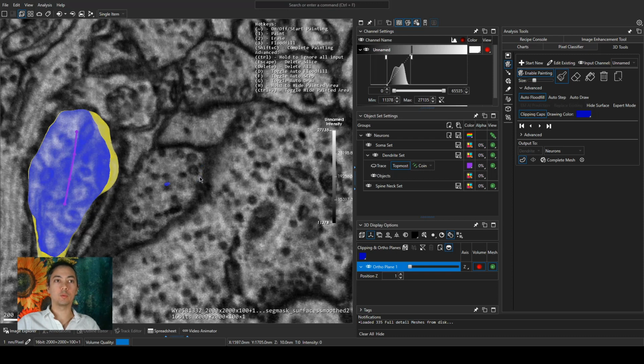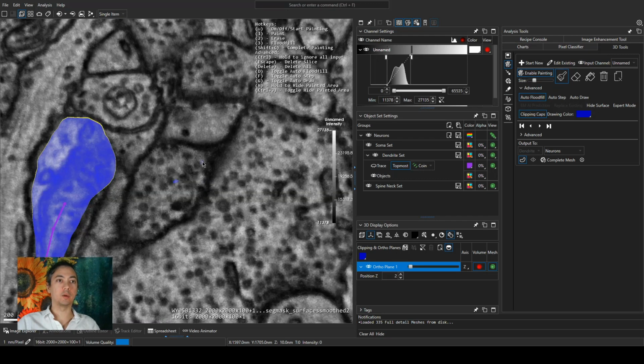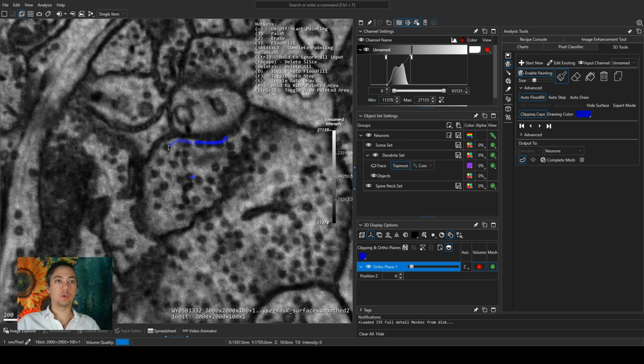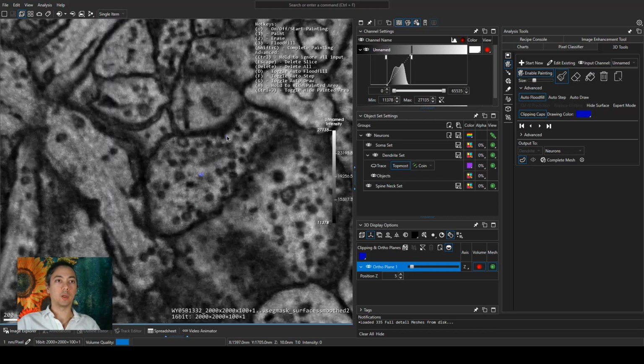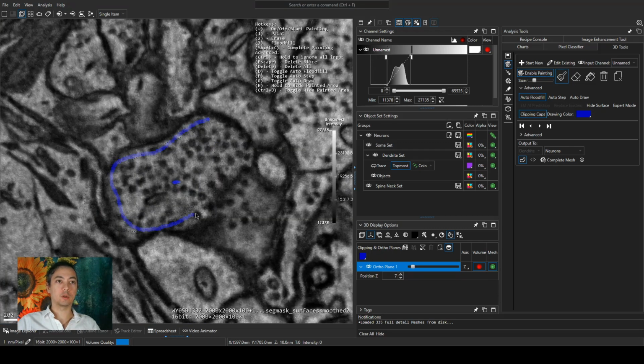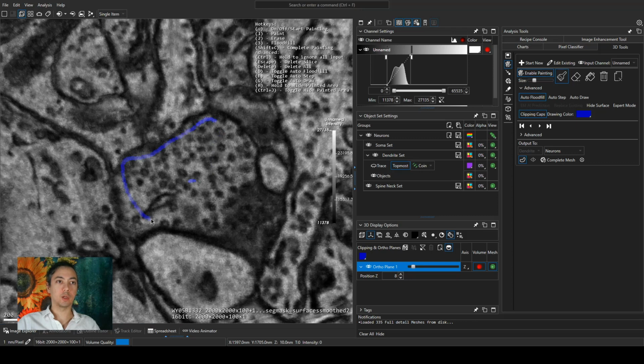And I guess normally you probably wouldn't use a mouse, or actually right now I'm using a ball mouse, a trackball, but maybe a pen or a tablet would be much better. But I'm just going to start going really fast here so we complete this quickly. And you'll note the flood fill actually closes itself off, so you don't actually have to do the last portion of it.